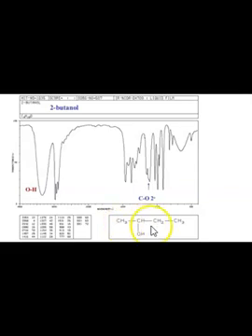I would point out that this hydroxyl group, this OH coming off of carbon number 2, they're pointing out that you have a secondary carbon. Here's this carbon, and it's attached to two others. At any rate, if this oxygen hydrogen group was over here, then you would get a different spectrum. It would be noticeably different, but not terribly different. And then again, here's that alcohol group, and then somewhere in here is the CO bond that they're pointing out there.